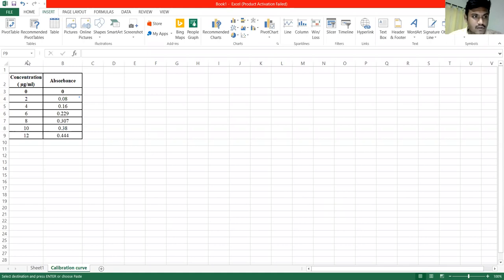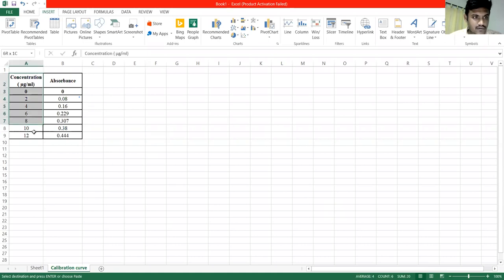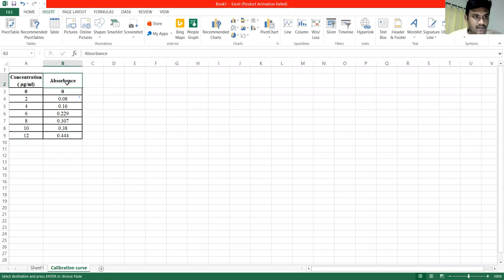We have different columns like A, B, C, D, E, F. We will enter these values. We will enter the concentration values in this column and the absorbance values in this column.